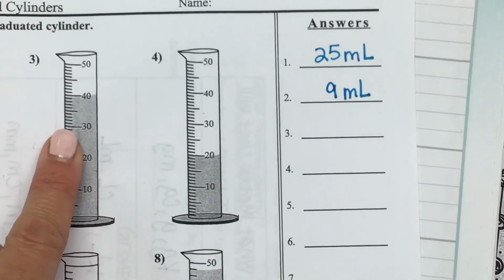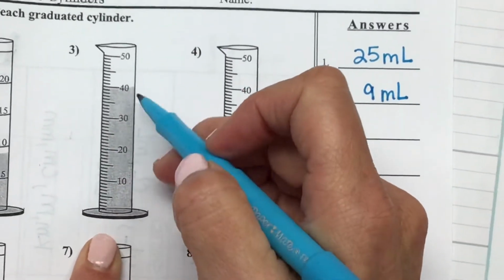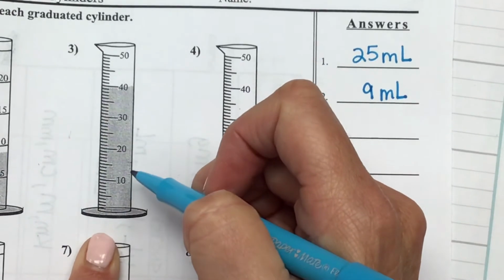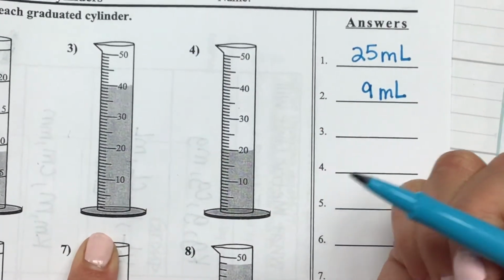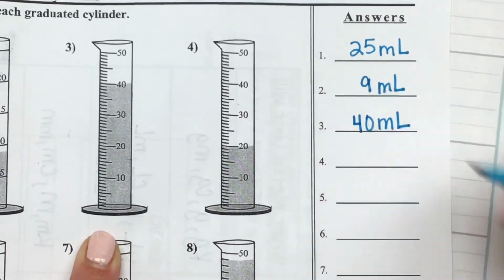Number 3. What is the volume of this liquid? What's it measuring to on number 3? Alex. I think 2. 40 what? 40 milliliters.